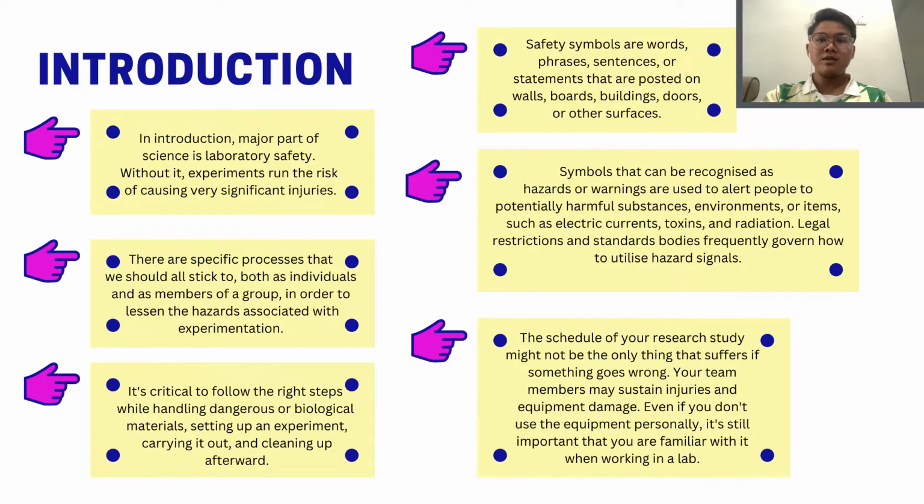So my part is introduction. In introduction, a major part of science is laboratory safety. Without it, experiments run the risk of causing very significant injuries. So there are specific processes that we should all stick to, both as individuals and as members of a group, in order to lessen the hazards associated with experimentation.